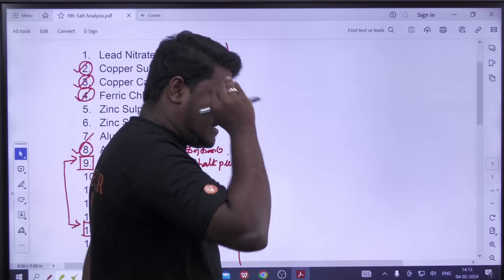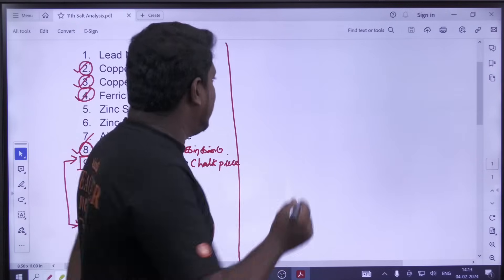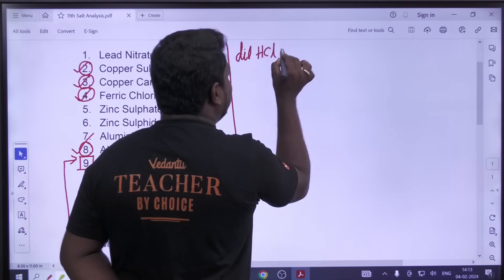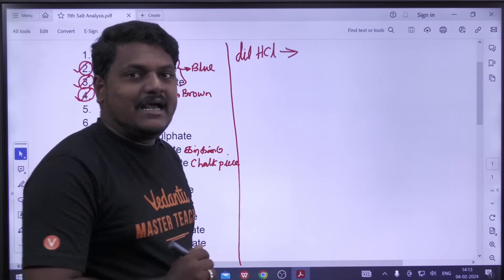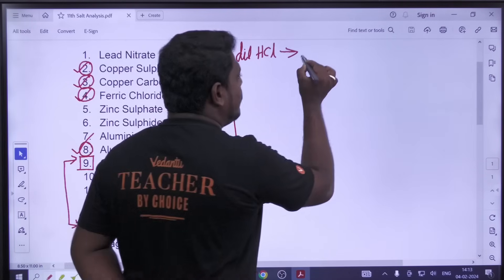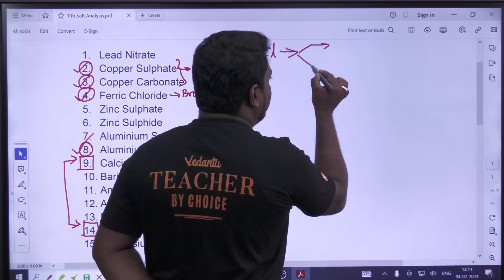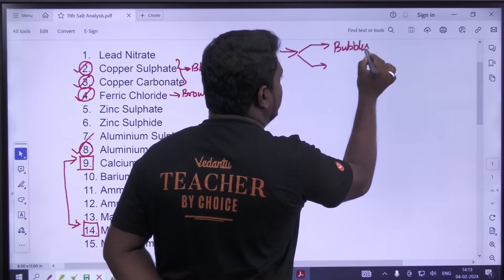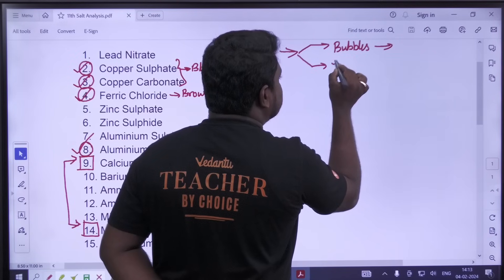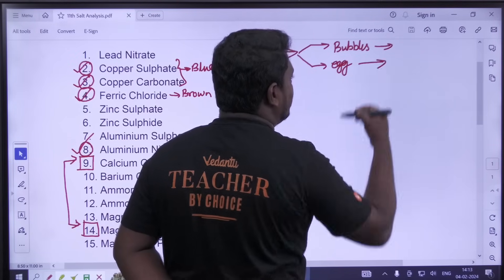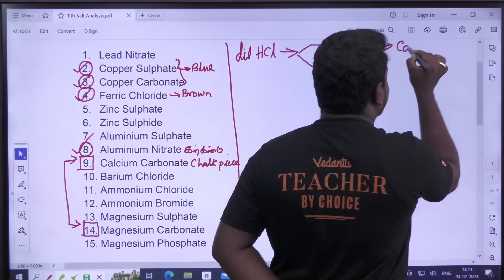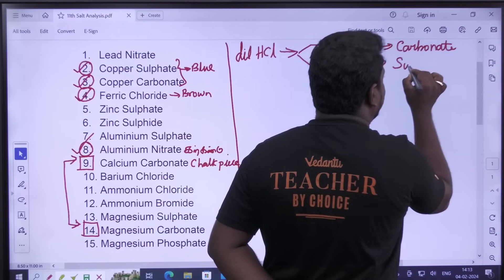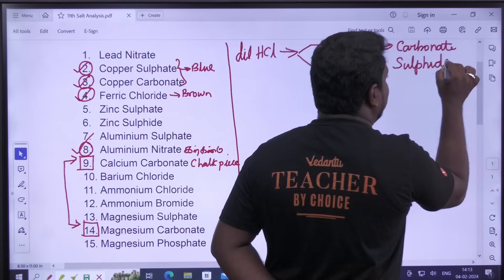If you want to test this, you will need your reagents or solutions. This is Dilute HCl — in Tamil, you will need the Hydrochloric acid, Dilute HCl. If you add this, you will need to observe two answers. Bubbles — bubbles are the same. This is the rotten egg smell. Bubbles mean it is carbonate. It is sulfide.